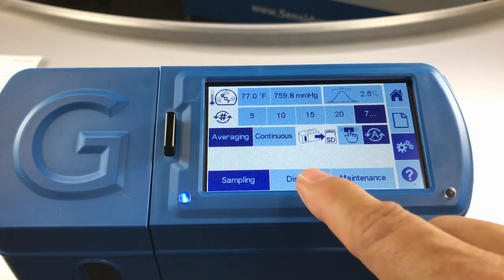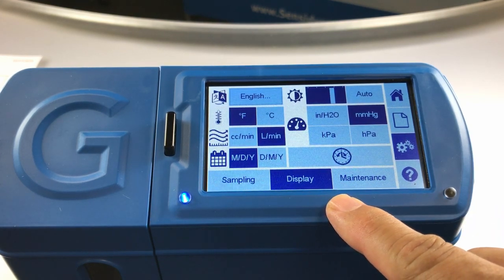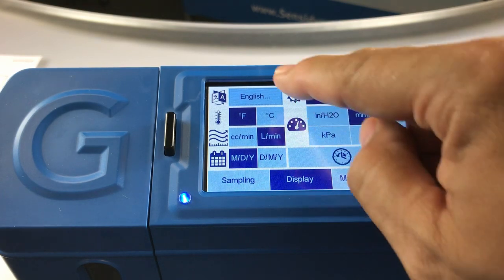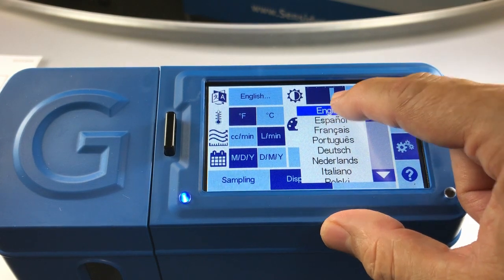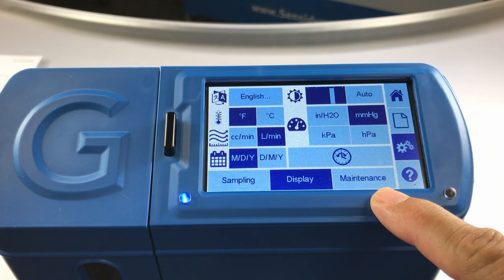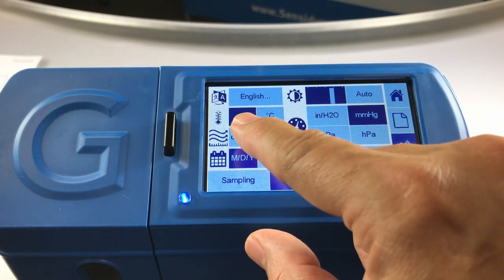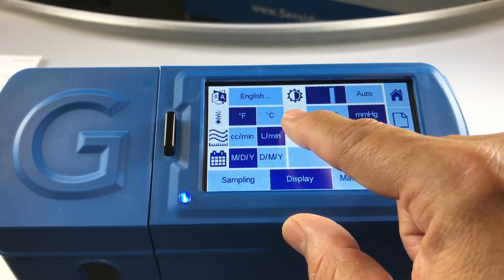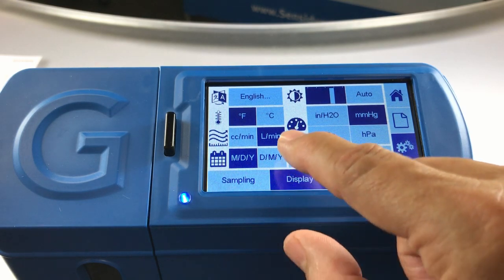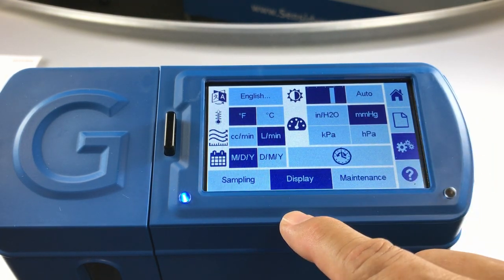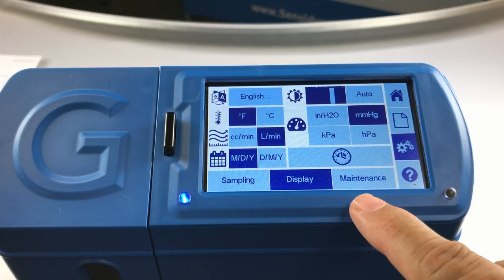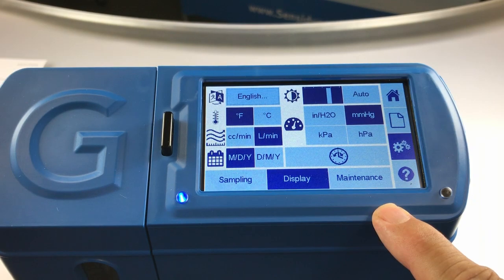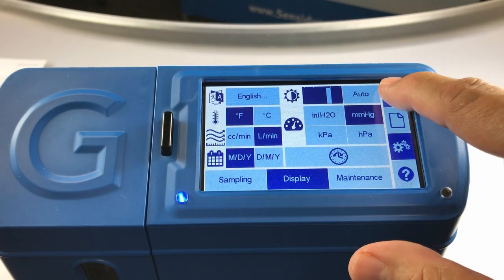Next, let's select the display screen. From the display screen, you may select your language — you have a choice of 10 languages. For today, we'll keep it in English. You may also select your desired preference for temperature in degrees Fahrenheit or degrees Celsius. We'll leave it in degrees Fahrenheit today and set it to liters per minute for volume. We'll also select our preference for date format as well as our units of pressure. When your preferences have been completed, press the home icon on the menu bar to return to the home screen.